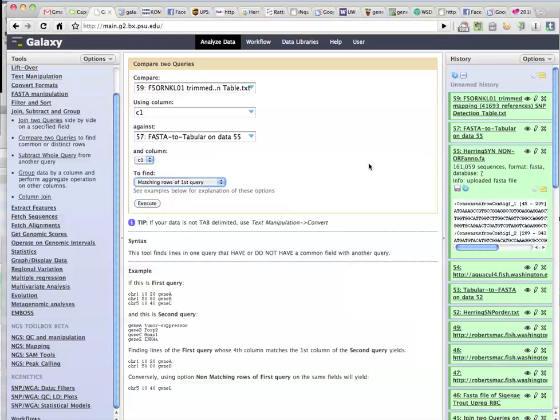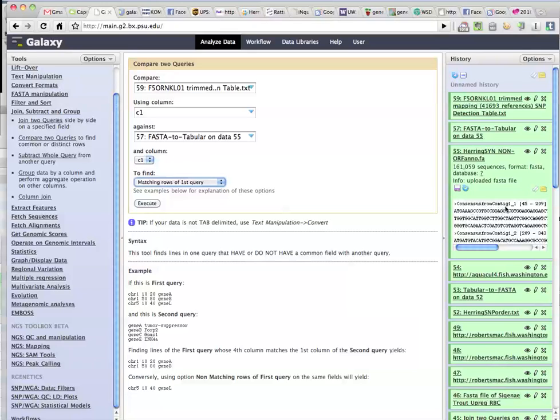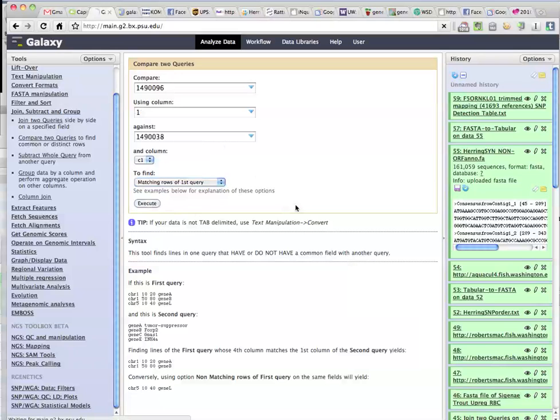Okay, so I don't know if this is going to work, but what I'm going to try to do is compare two queries. So take the SNP table, column 1, which is the name of the sequence, against the FASTA to Tabular, column 1, which should be the same name, something like consensus from contig 1 underscore 1, and find the ones in this data or from the original sequences that have SNPs. Let's see if that's going to work.